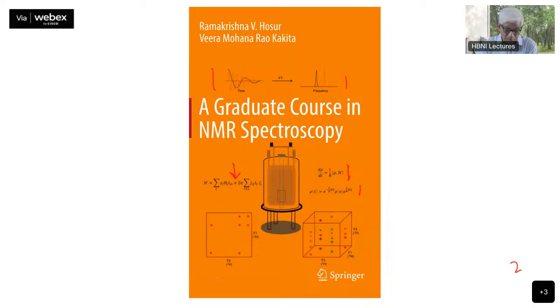And then we have this 2-dimensional spectroscopy here at this point and 3-dimensional spectroscopy at this point. So these are contained in different chapters in the book. So you might be better off getting access to this book if it is possible for you. Okay. So from here we will continue, and the next few lectures is going to be a fair amount of, well, I'll try to minimize as much as possible, some amount of mathematics is required. Some principles, wherever it is necessary, I will try and explain the ground principles over there.